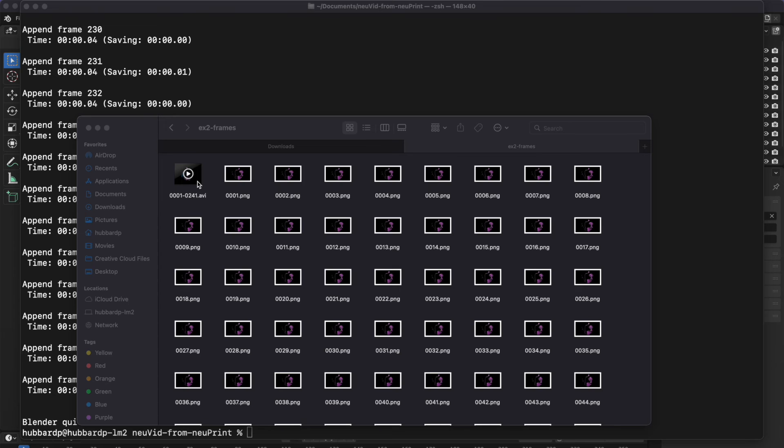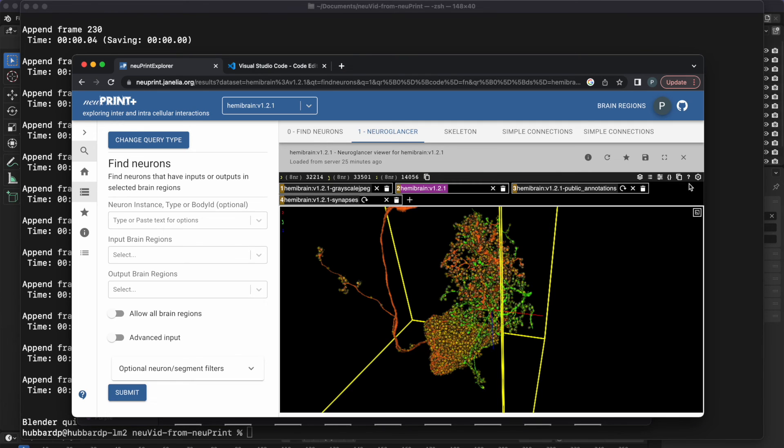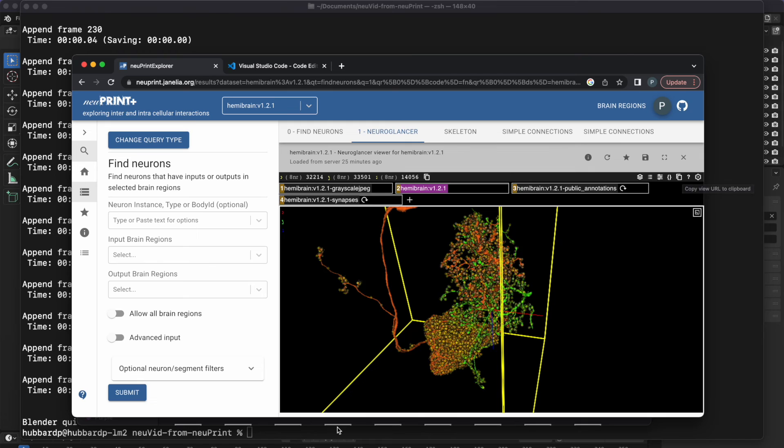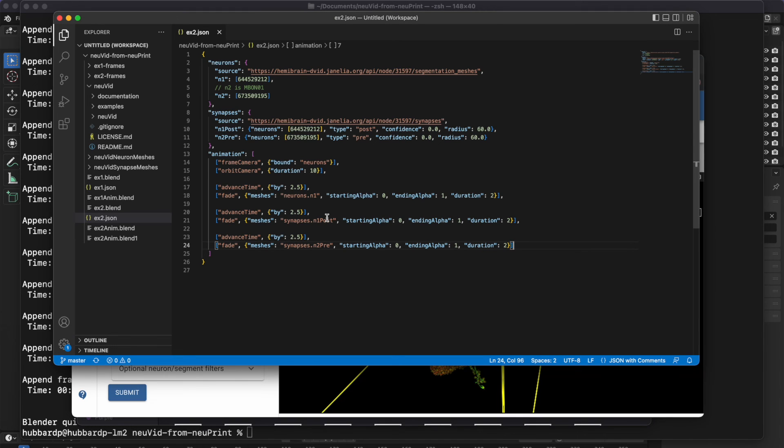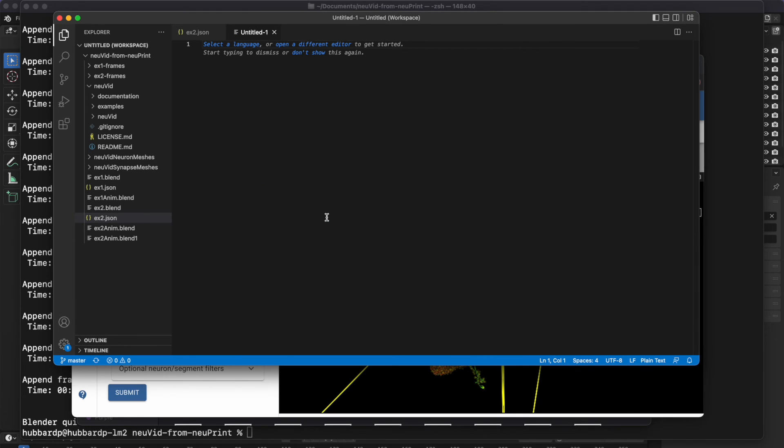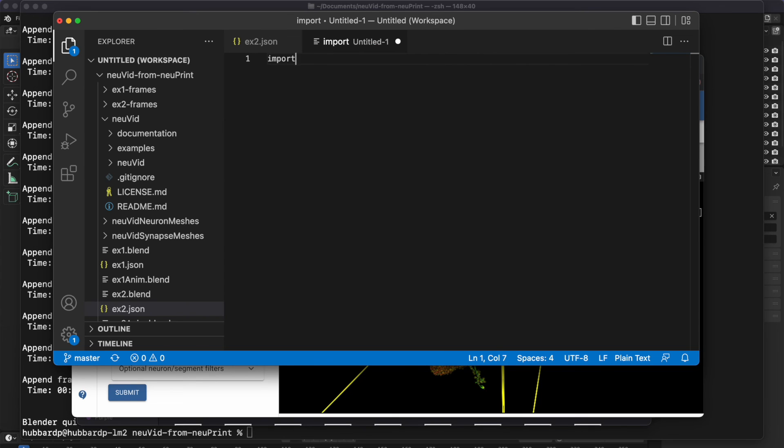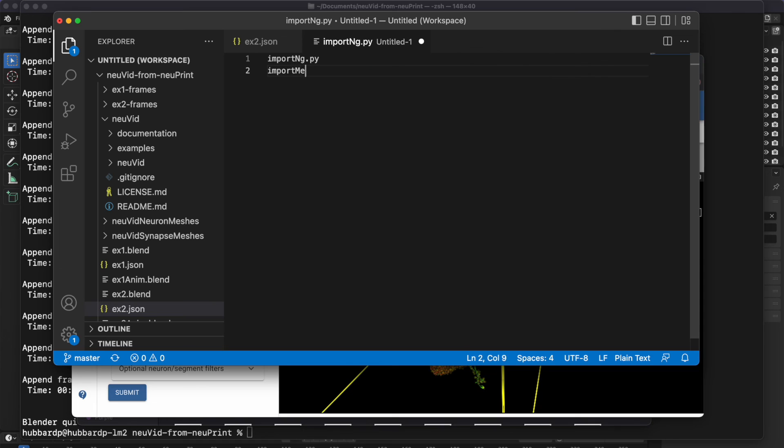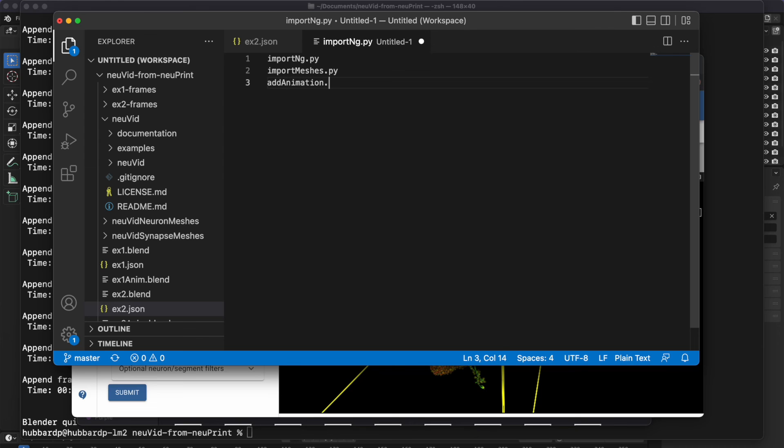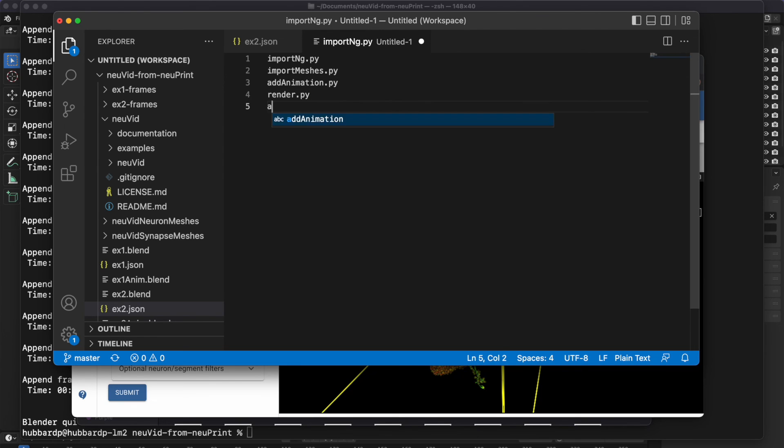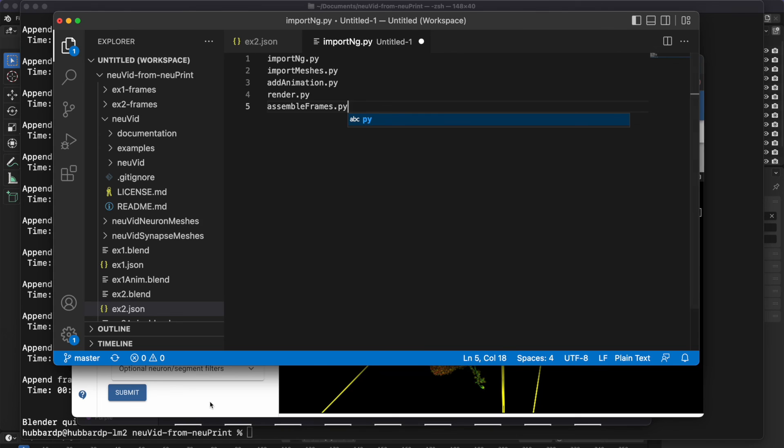To wrap up, here's a summary of the steps again. In neuPrint, copy the NeuroGlancer URL into the clipboard. And then run the neuVid scripts. To remind you of the order, I'll just write them out. First is importNg.py. Then it's import meshes. Then add animation. Render. And finally, assemble frames. If you discover any problems as you're doing this, feel free to create an issue on the neuVid GitHub site.